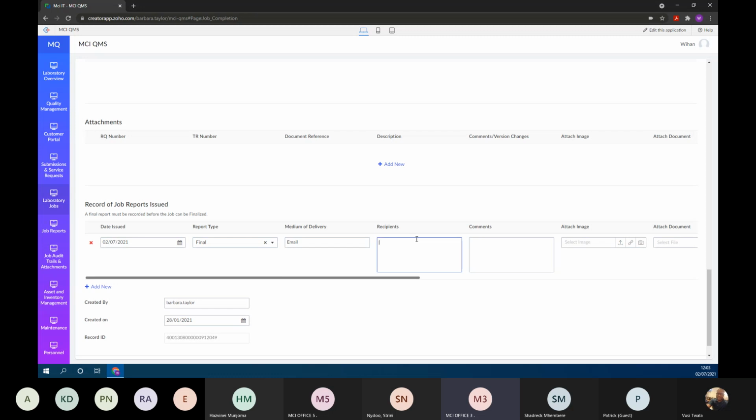And again, it can be submitted in various ways. So the system does not limit the user to say, oh, it can only be sent via automated email. In some cases, let's say some of our customers test feed products and seed products. They have to issue a certified hard copy of the results, whether by courier or post, to the container ship before it can leave the harbor.